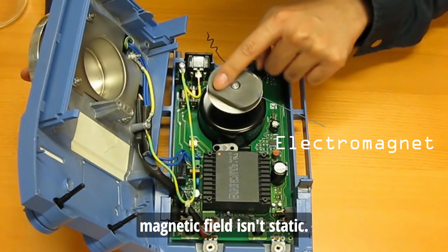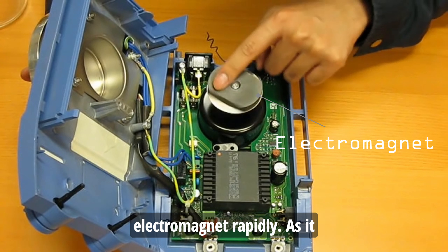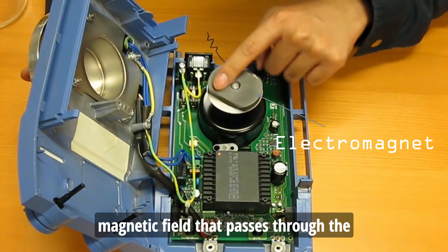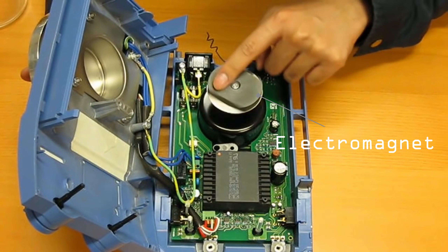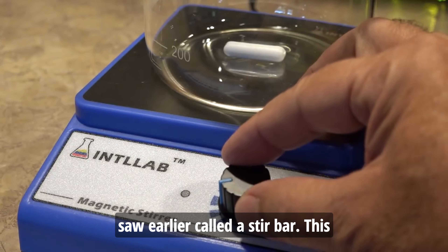This magnetic field isn't static. The motor inside the base spins this electromagnet rapidly. As it spins, it creates a constantly rotating magnetic field that passes through the stir plate and reaches up into the flask. Now, let's talk about that tiny capsule we saw earlier, called a stir bar.